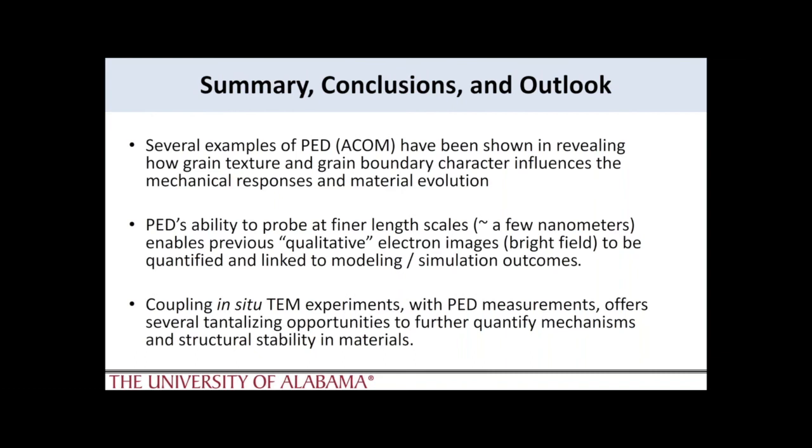One of the advantages of PED is that it has the ability to probe really fine length scales of only a few nanometers, and it takes previously qualitative electron-based images to quantitative data that can be used for modeling and simulations. And then finally, I think this whole coupling of in situ TEM offers a really exciting and new area where all these techniques can come together and support each other.